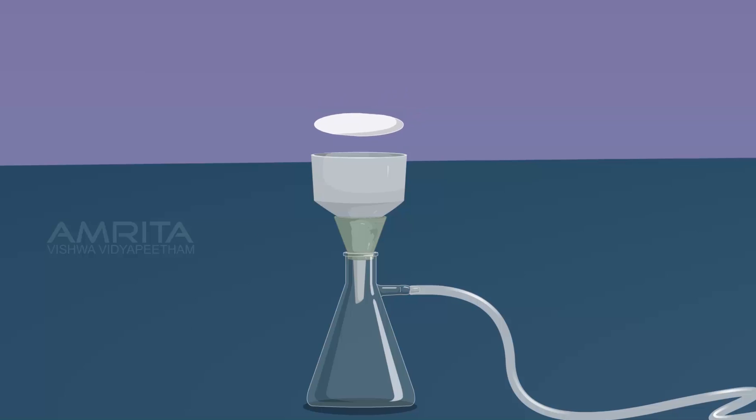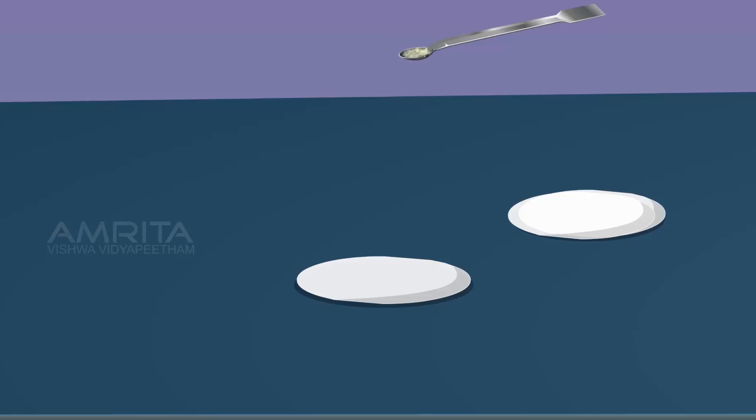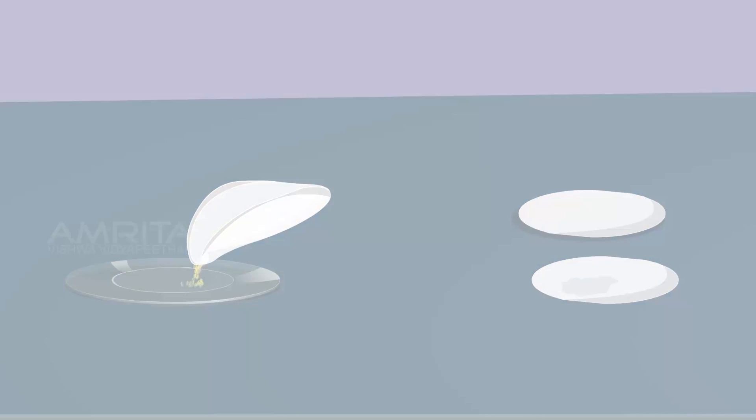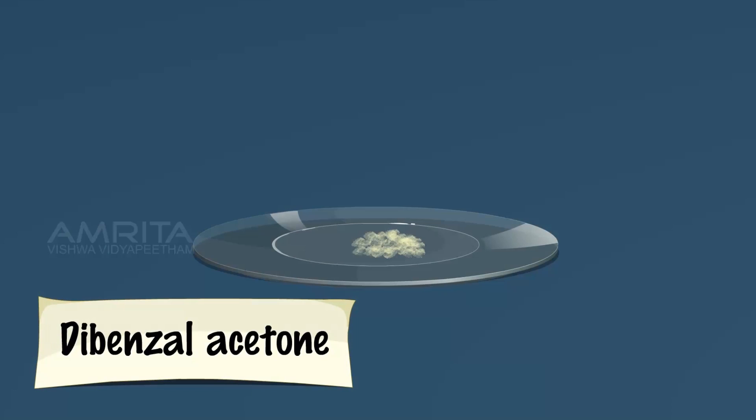Filter the crystals using Buckner funnel. Using a spatula, transfer the crystals onto a filter paper and dry them by pressing them between filter papers. Transfer the dried crystals into a watch glass and label it as Dibenzal acetone.